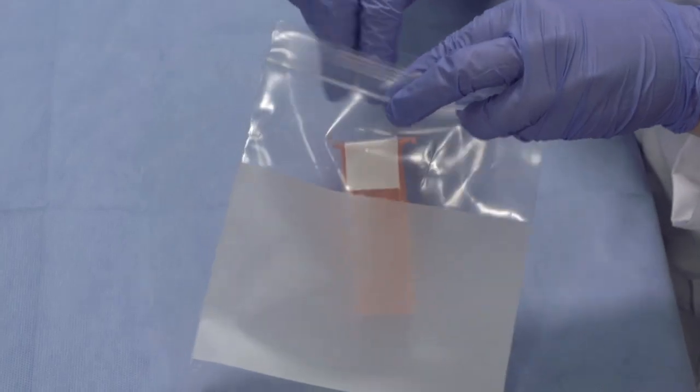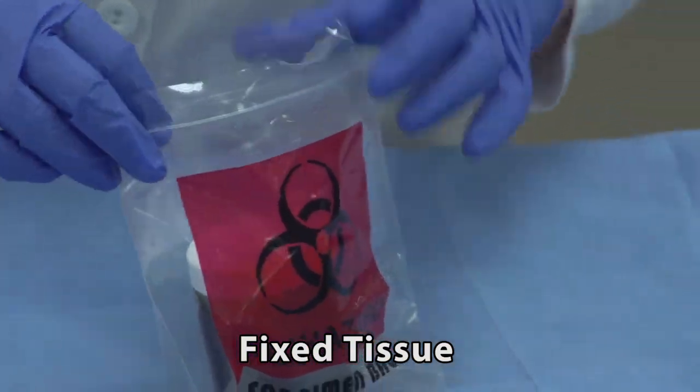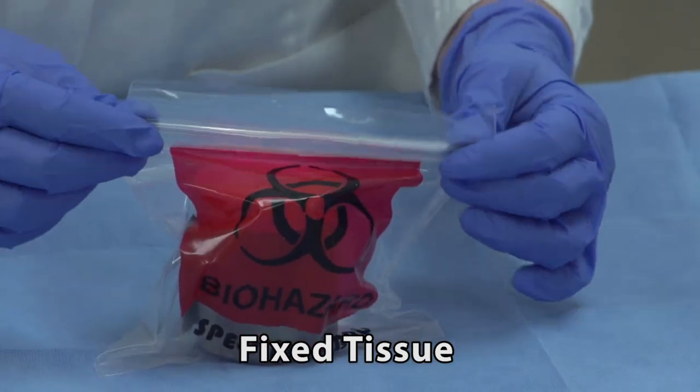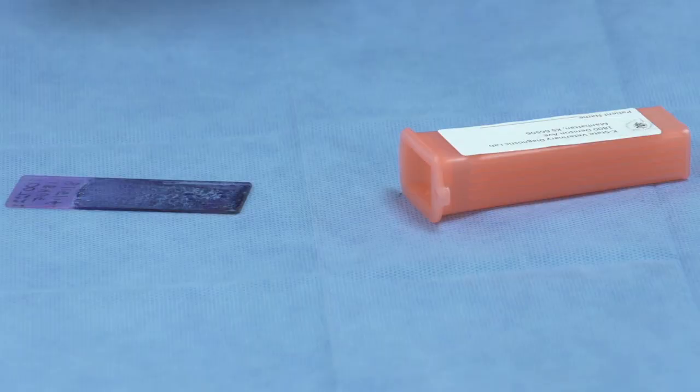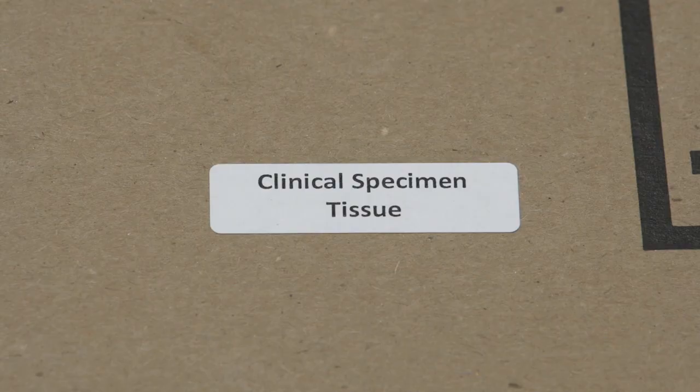Cytology slides should also be protected from formalin and its fumes by individually bagging the slides and any fixed tissues sent with them. Dried slides are not considered potentially infectious and do not require UN-3373 labeling. The outer packaging should be labeled animal medical or clinical specimens.